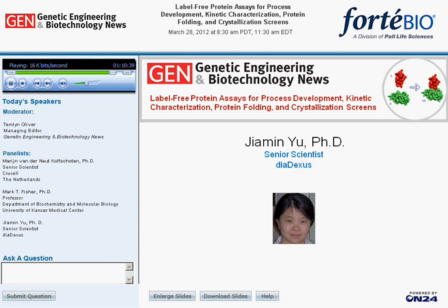I did not try this, but another colleague at Novartis did, and I think his comment was that it wasn't working quite as well as the anti-His antibody because the antibody was giving better sensitivity. I don't know how many different NTA materials he has tried, but maybe there are materials out there that you could use to see if it works. But I think it should work if you can find the NTA that will give you good binding characteristics.